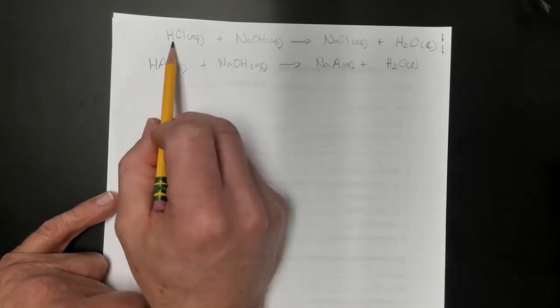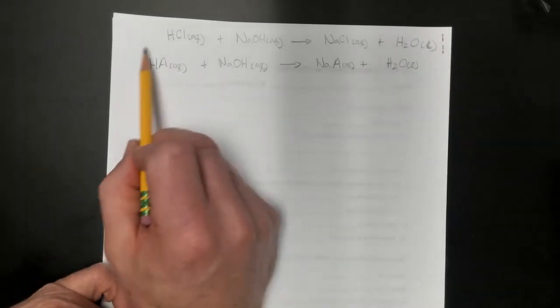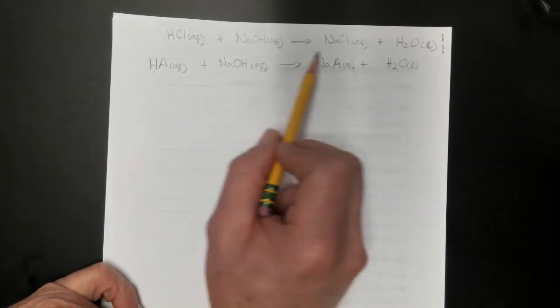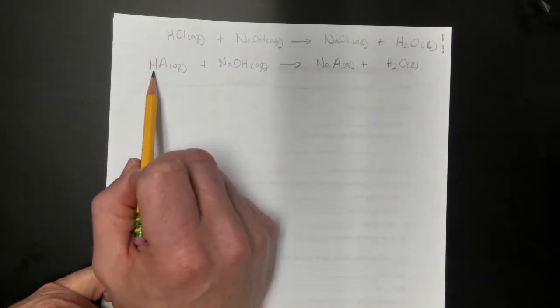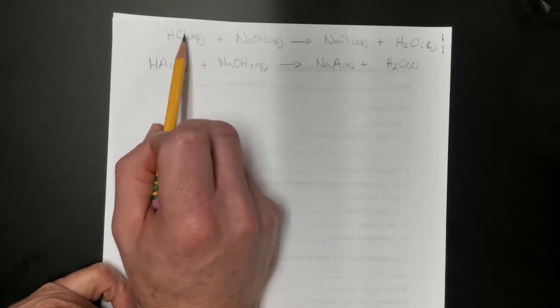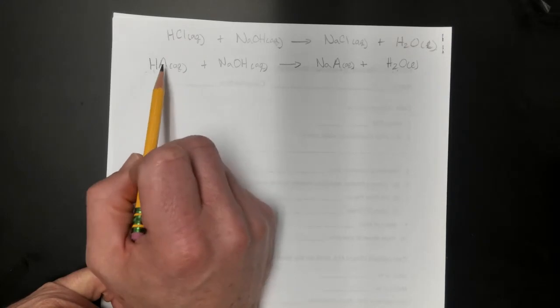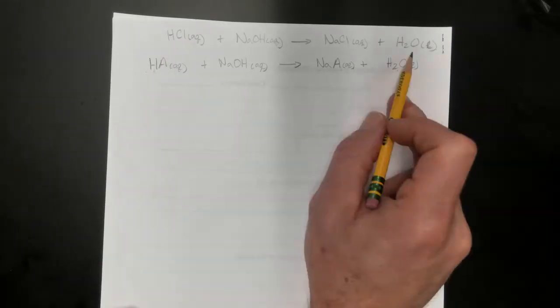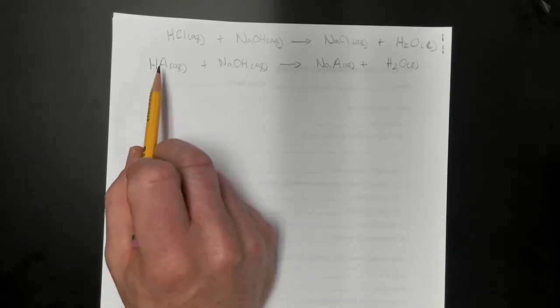Again, this is a specific reaction. This is the general reaction that's going to cover both of the reactions that we do today. And HA is just written in generic form. HA is represented by HCl here. The A part would be the chloride. And this H, of course, is the hydrogen. Okay, so this is the overall reaction. And the point being, the stoichiometry is 1 to 1 to 1 to 1.